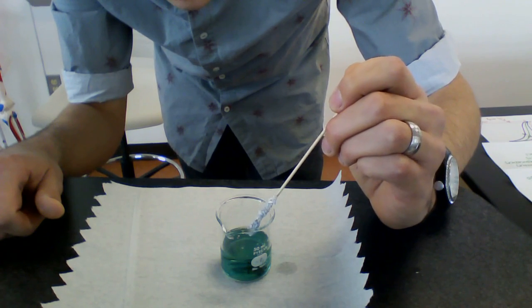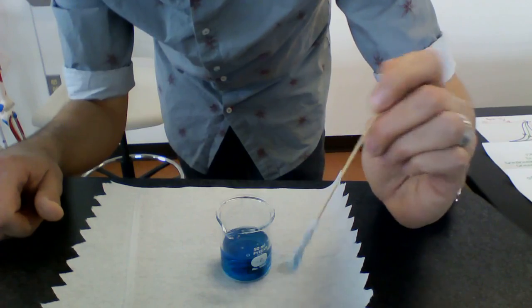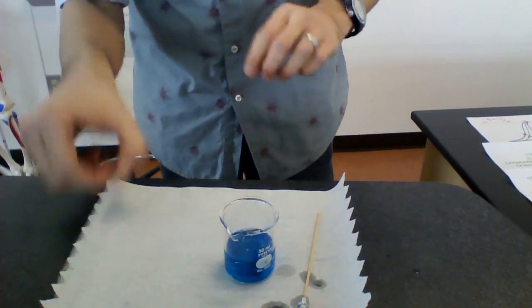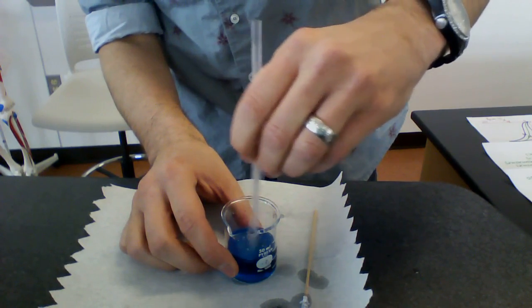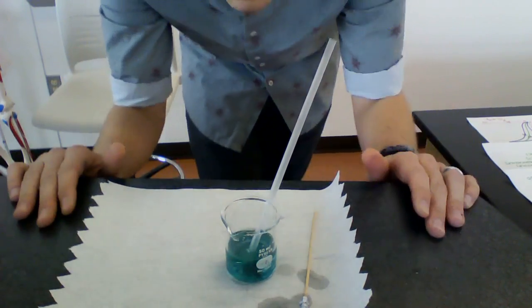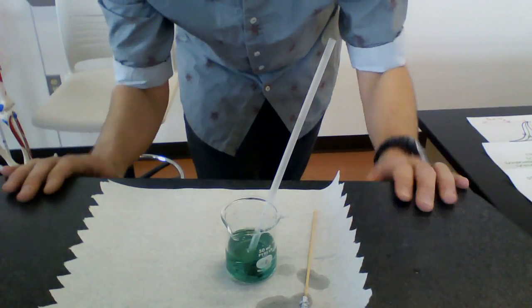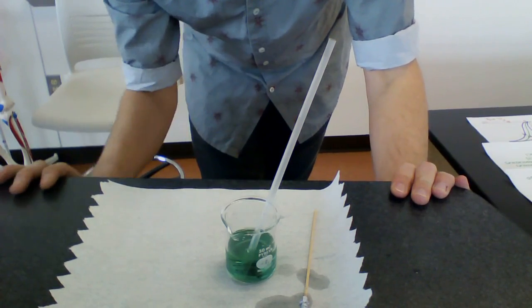And it wants to turn green until, there we go. I will stir it until it turns green. There we go. Okay, so now we're back to green, and we pulled it left. Now you see that very easily we changed the pH.